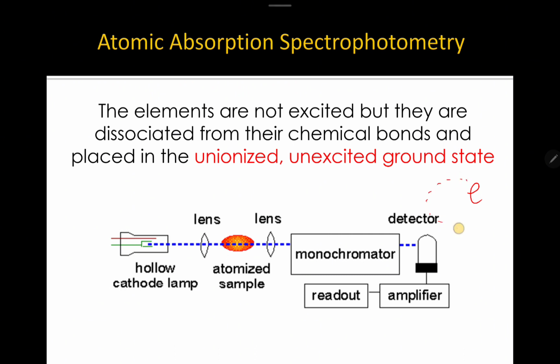Pag malapit na siya ma-excite, yung amount of light na kanyang na-absorb, let's say for example, ito yung electron natin na nasa ground state siya. 'Di ba? Pag ma-excite na siya, mag-jump around naman na siya, mabuang naman na siya, mag-liuk-liuk naman na siya. So ngayon, ang gina-measure natin dito is yung amount of light absorbed niya before siya maging excited. Yun lang yun siya guys.